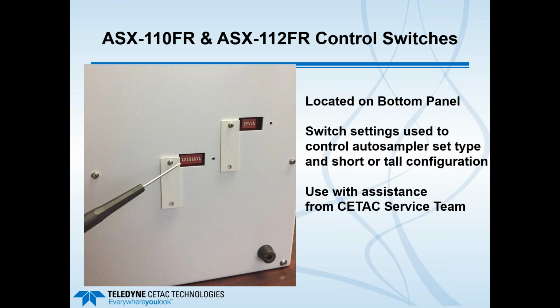The one that I'm pointing at is typically the most important one with the 8 dip switches, but normally users would not go into these unless they did need to make a configuration change, say they're moving from one model ICP-MS to another or short to tall. Certainly do that with assistance from the CETAC service team, and they'll be happy to help you with that.